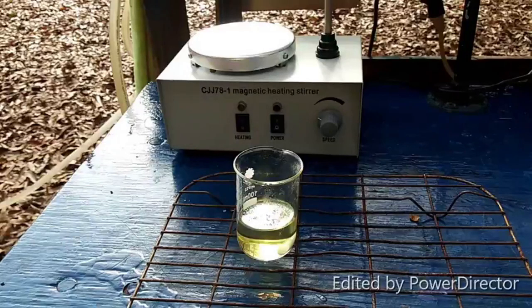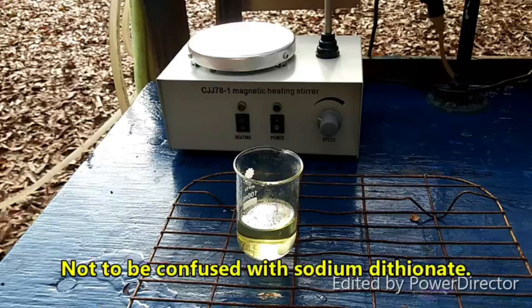Hello everyone and welcome back to the Poor Man's Chemist. In this video we are going to be making sodium dithionite, which is an air-sensitive reducing agent.